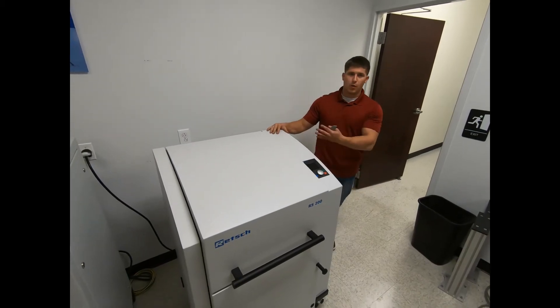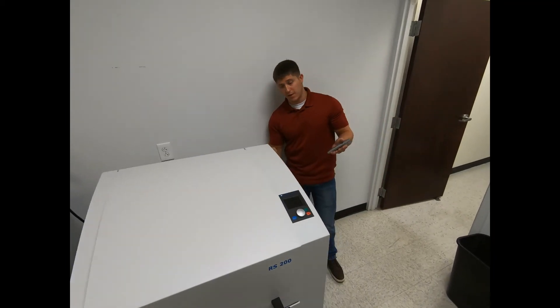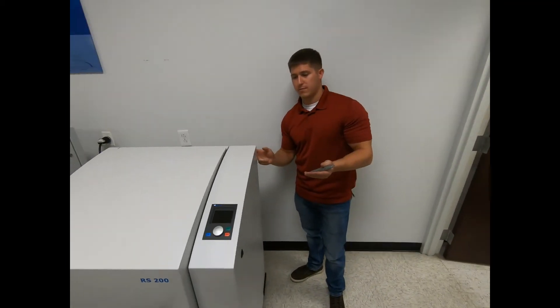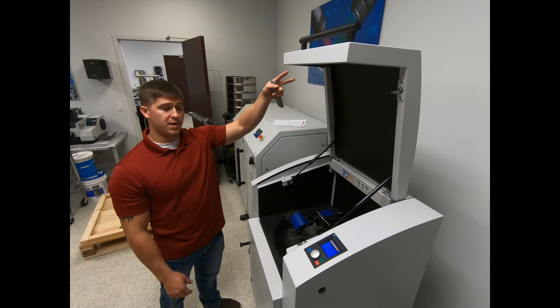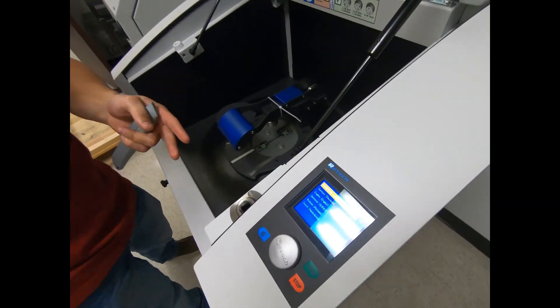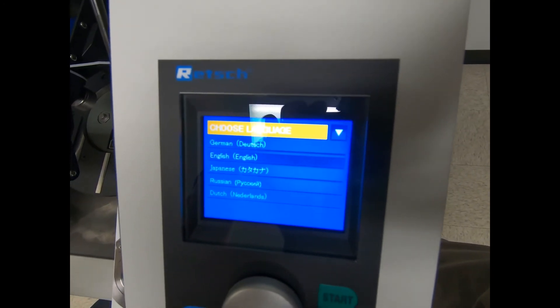Once you have your plug wired on and plugged in, hit the power switch located on the back of the unit. Once the unit is powered on, you can open it up and you'll see a welcome screen with a couple of different language options, so you can choose which one corresponds to you best.